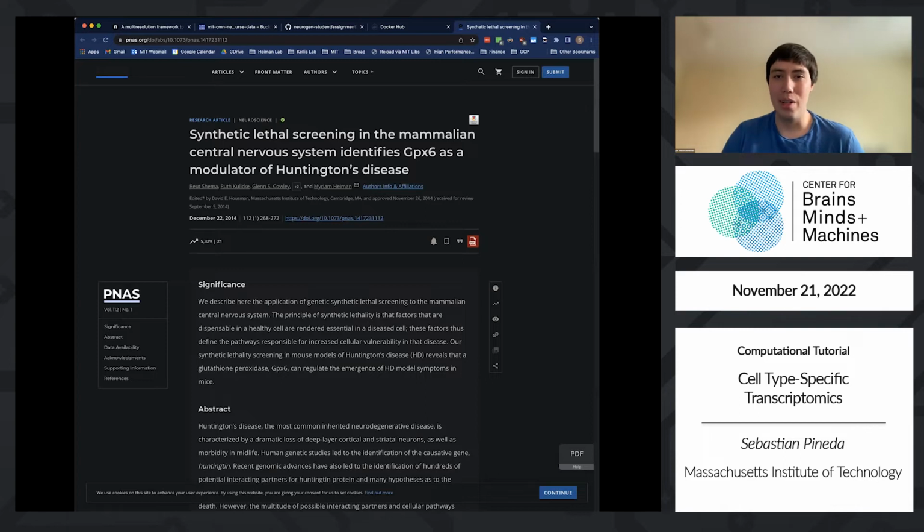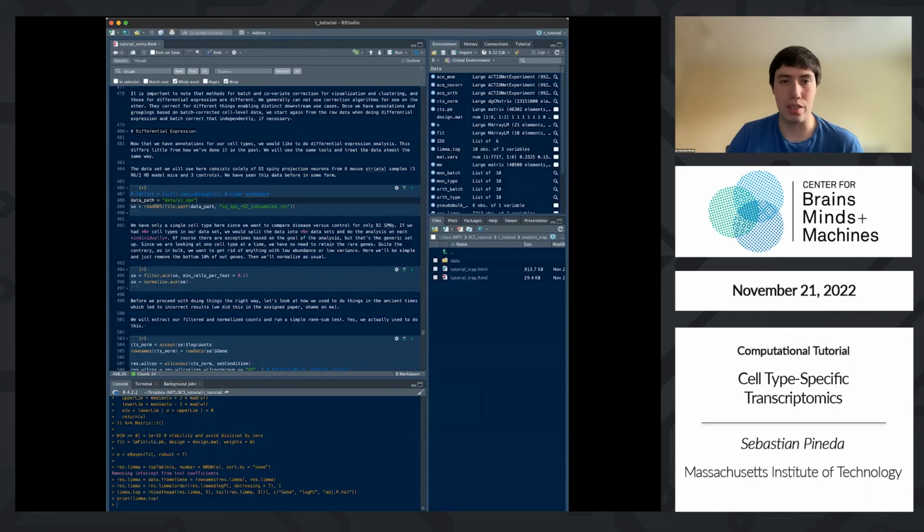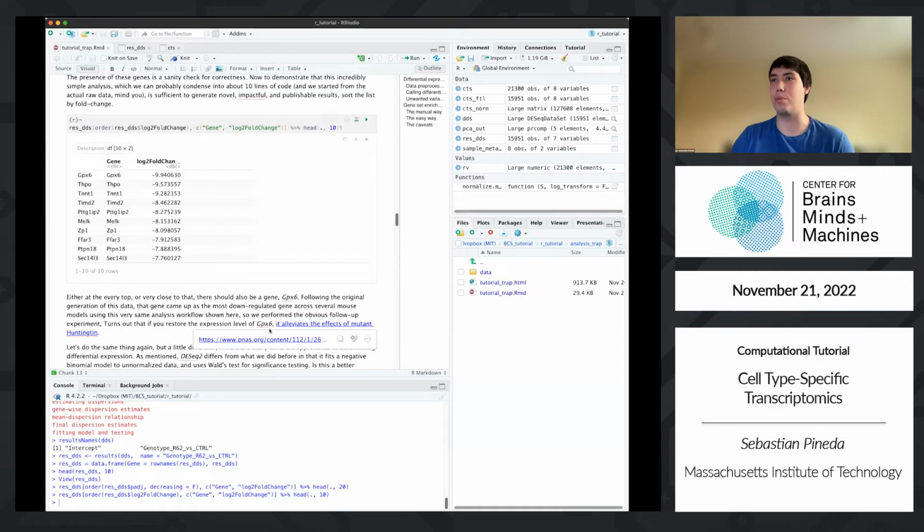So this type of data is actually very simple to work with. And because it's already so clean right off the bat, we have to do very, very little to start off. Let's see, this is the wrong one. Where I think I lost. Oh, there it is. So I have two windows open because I wanted to preload the single cell data analysis part.